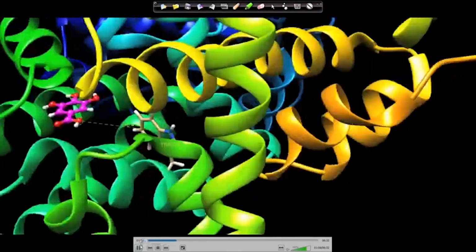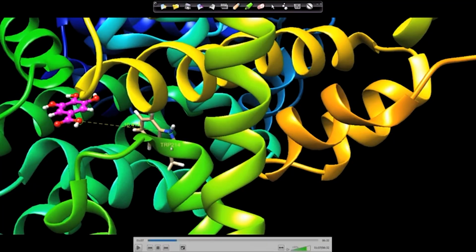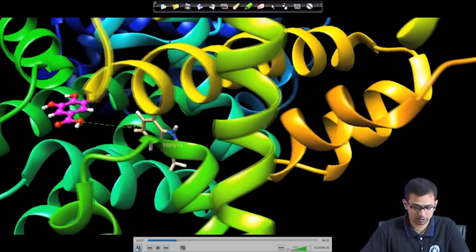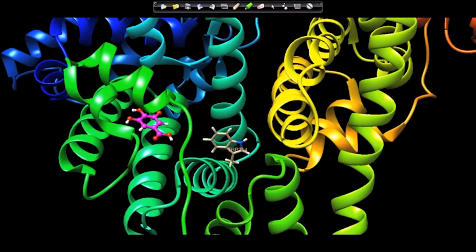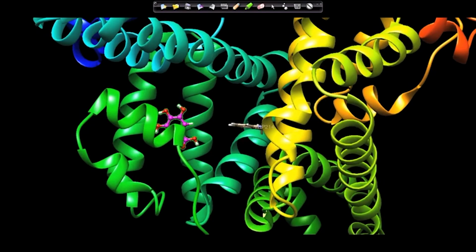Okay. So, here we have selected one of the atoms, the nitrogen atom of tryptophan, and the second atom we have selected is the oxygen, the OH group oxygen of gallic acid, and we are measuring the distance. So, let us see, the distance is around 10.4 angstrom. This is just the average distance of gallic acid from our tryptophan residue of HSA.